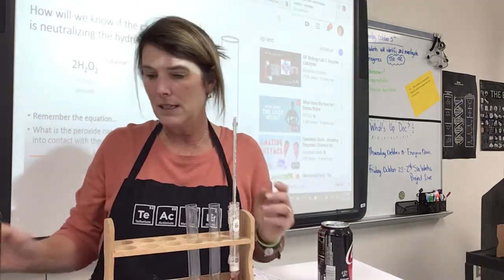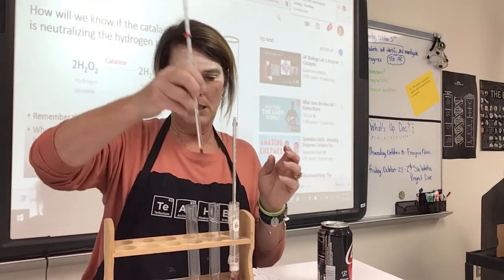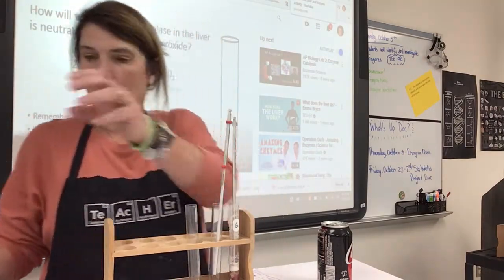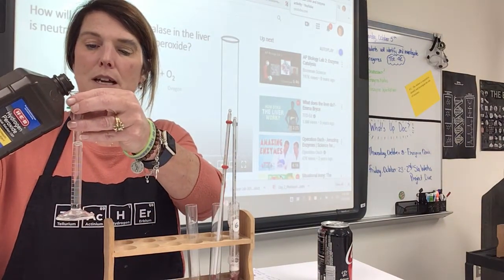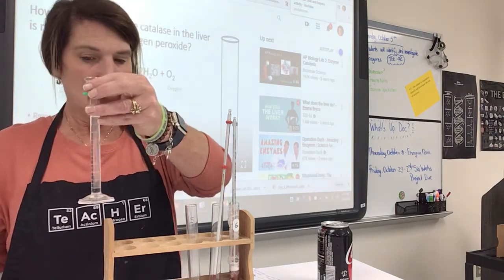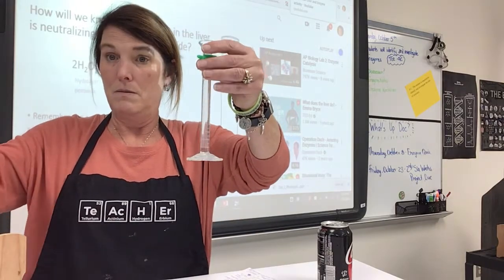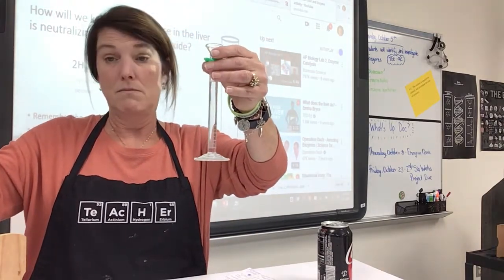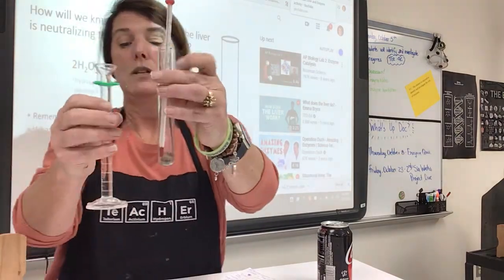Now our cooked enzymes, we're going to do the same thing. We need that thermometer in this one. Okay, we need 10 more milliliters of hydrogen peroxide. Whoa, that never happens. Your teacher got exactly 10 milliliters. Okay, here we go. What do you guys think? Hypothesis. A lot of bubbles? Not too many? You shall find out.